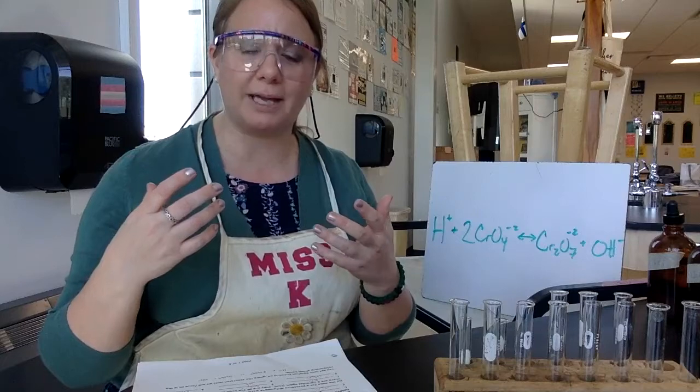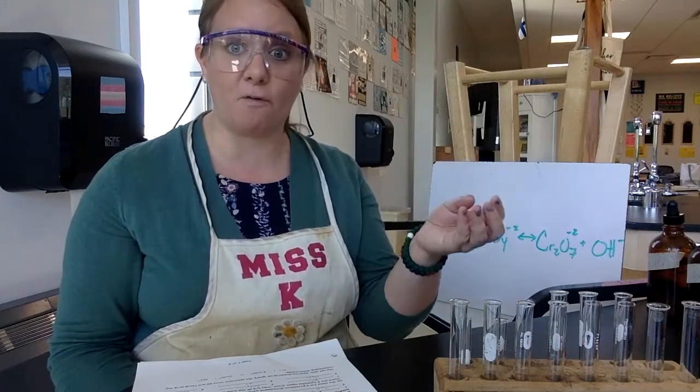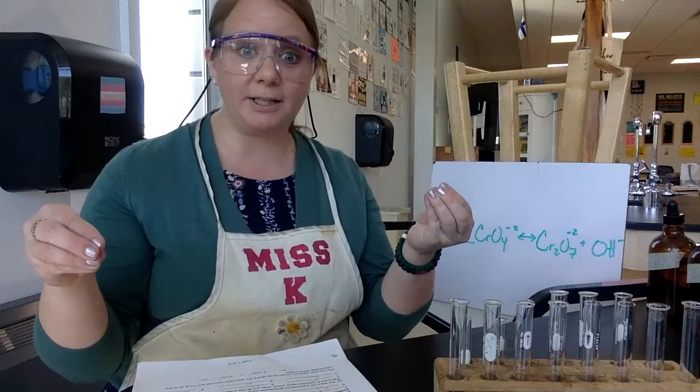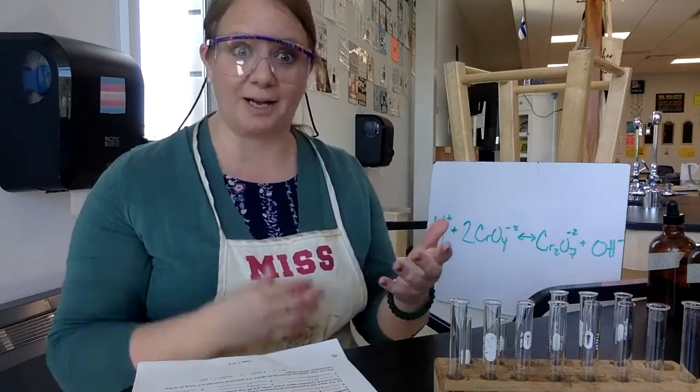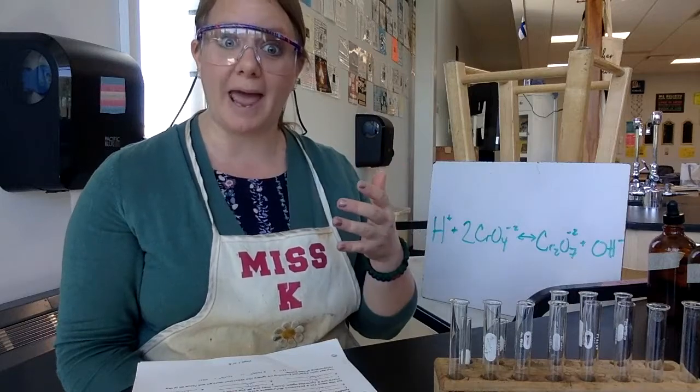And then specifically for this lab, you'll see that there's the cool chemical reaction of if you have the chromate ion, CrO4 2-, you automatically also have Cr2O7 2-, the dichromate ion, which is a neat thing. And they're different colors, so we're going to be able to see in this lab which thing we have. So this is the equation we're going to keep referring to.